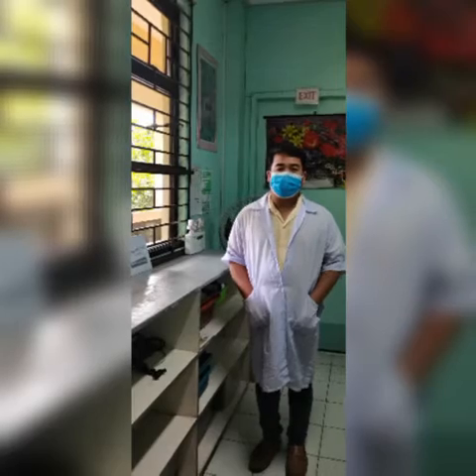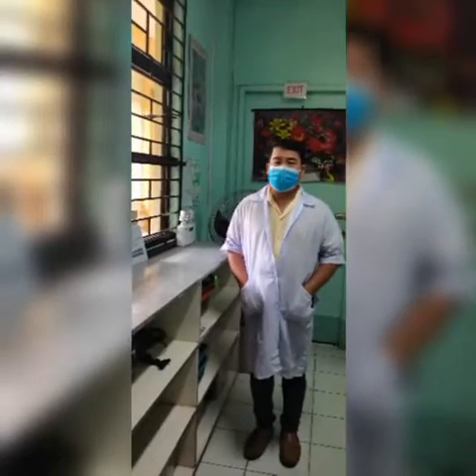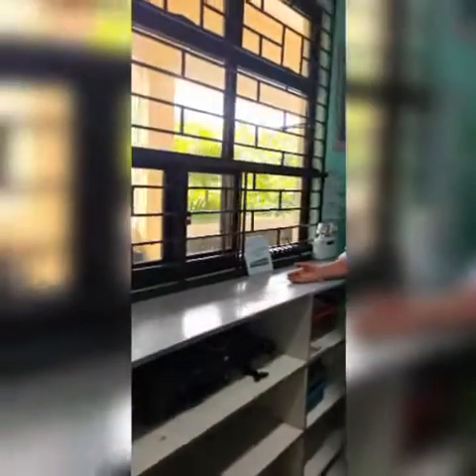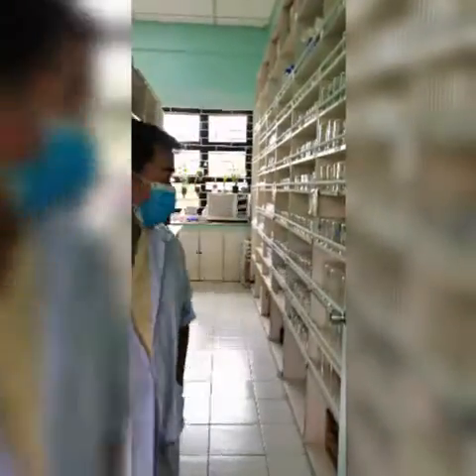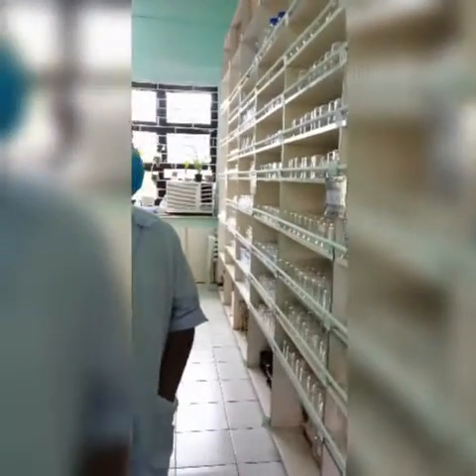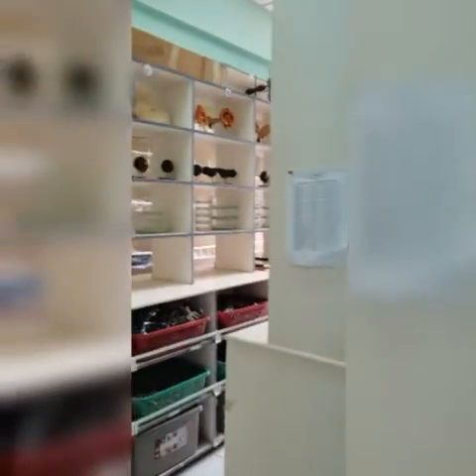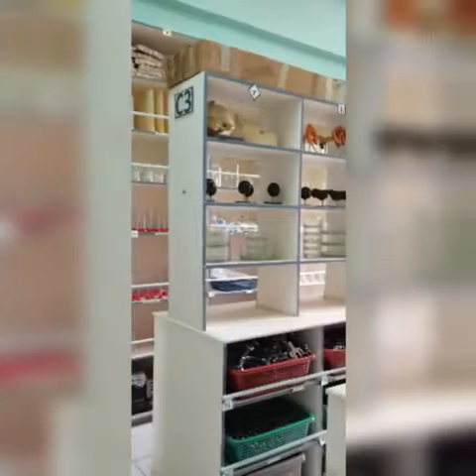This is the actual office of the apparatus section. It is where the in charge of the apparatus section actually stays to accommodate students and faculty for their laboratory needs. Specifically, this area is the counter where the releasing and receiving of the materials happen. And inside, you can find the various laboratory devices or glasswares for science experimentation. So here you can find an array of laboratory glasswares ranging from beakers to volumetric flasks, Erlenmeyer flasks, graduated cylinders, and other metal laboratory materials, the iron stands, the extension clamps, and other necessary materials for the laboratory.